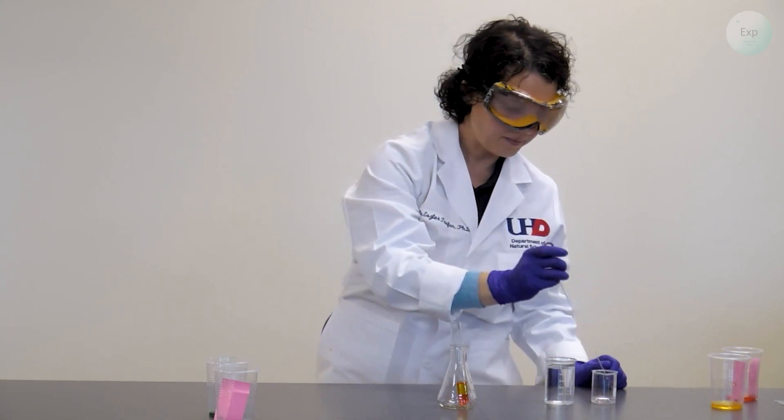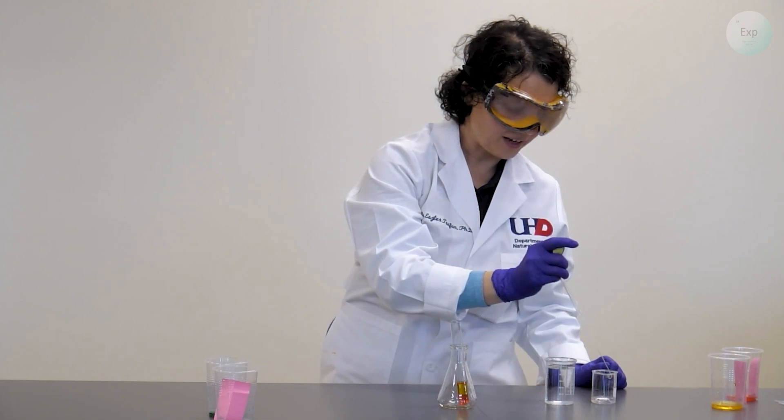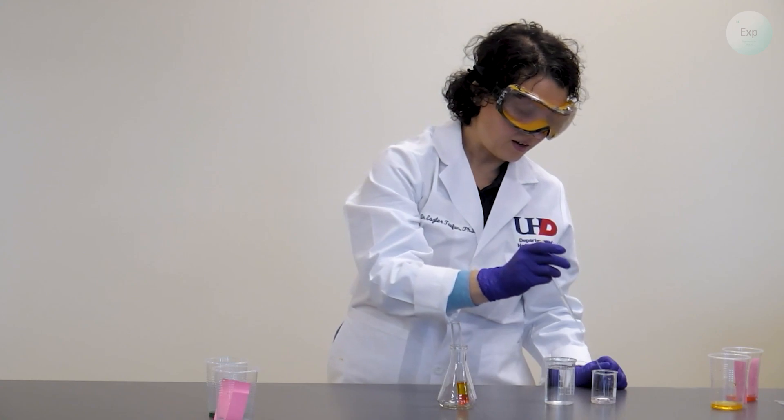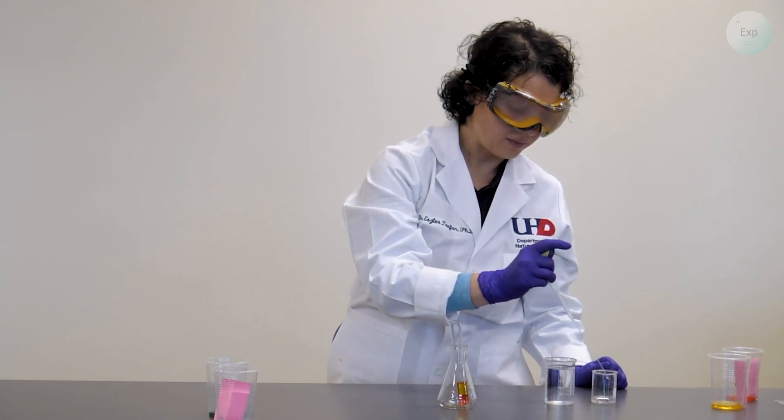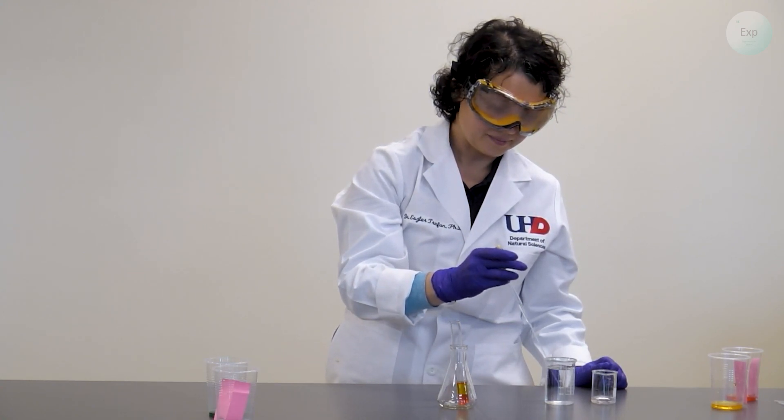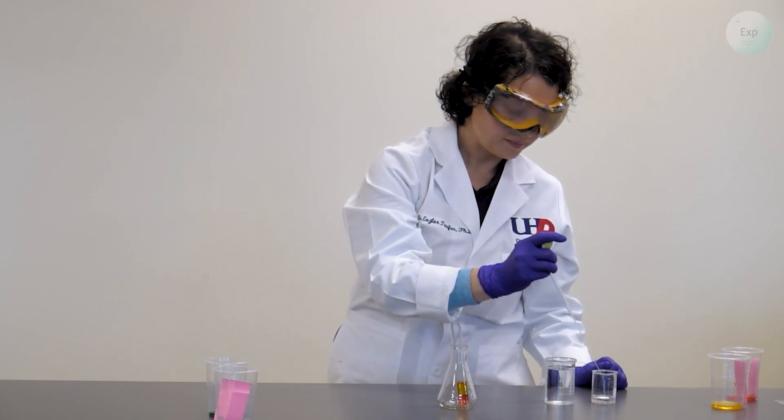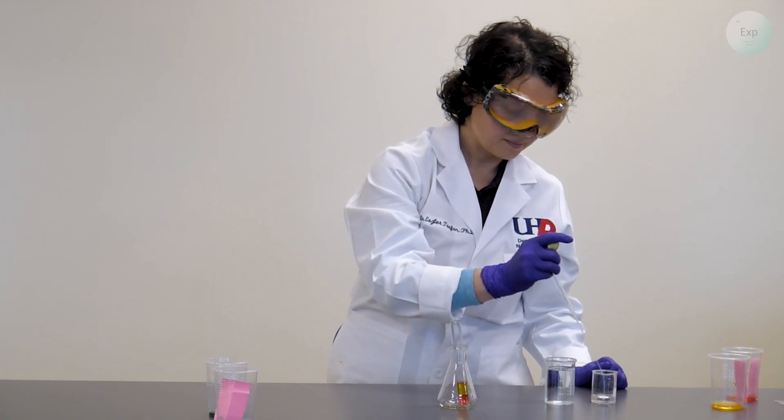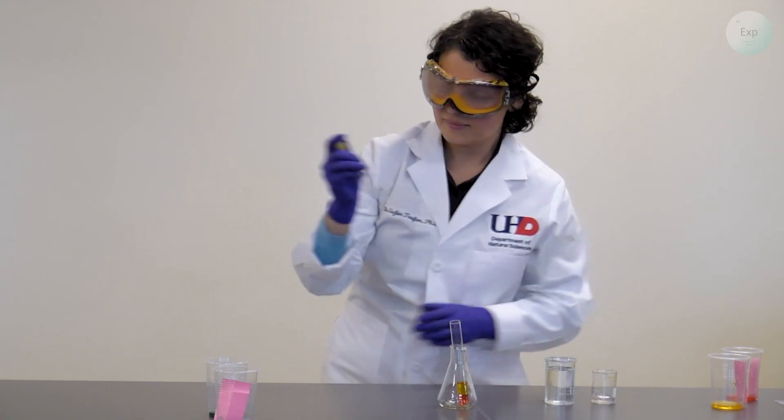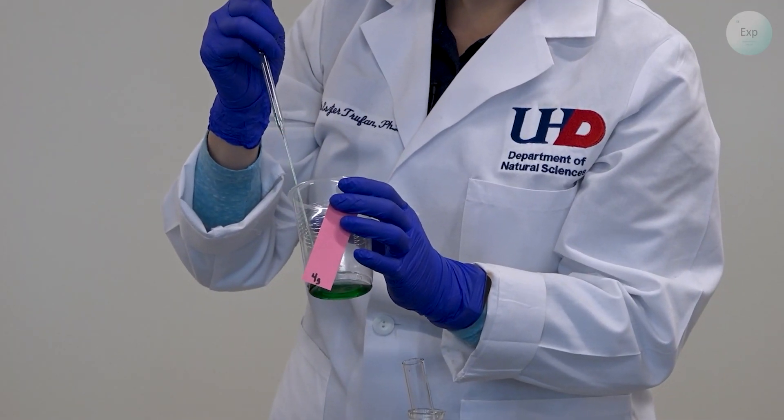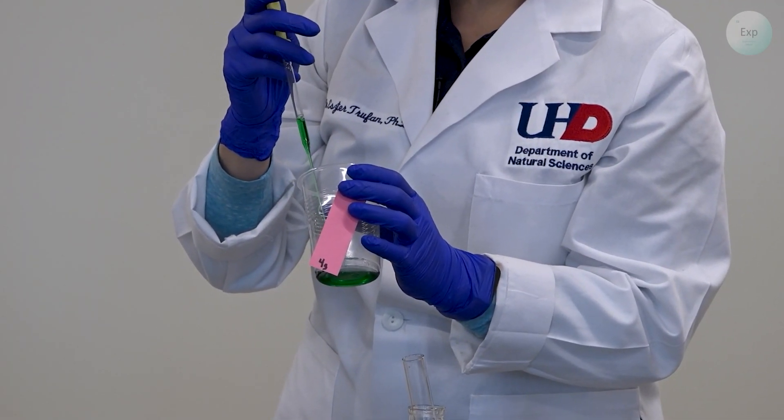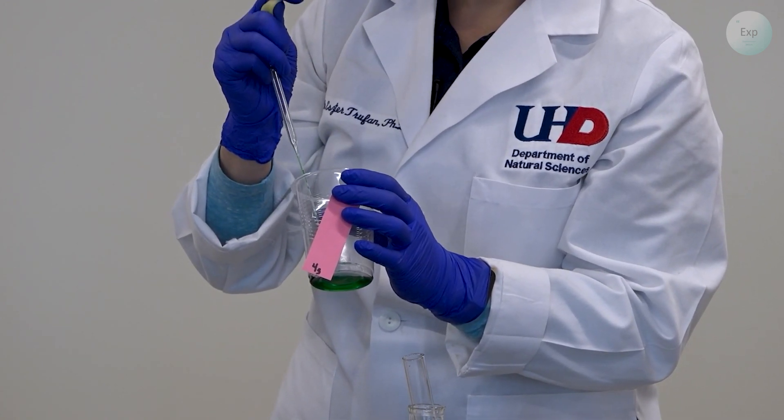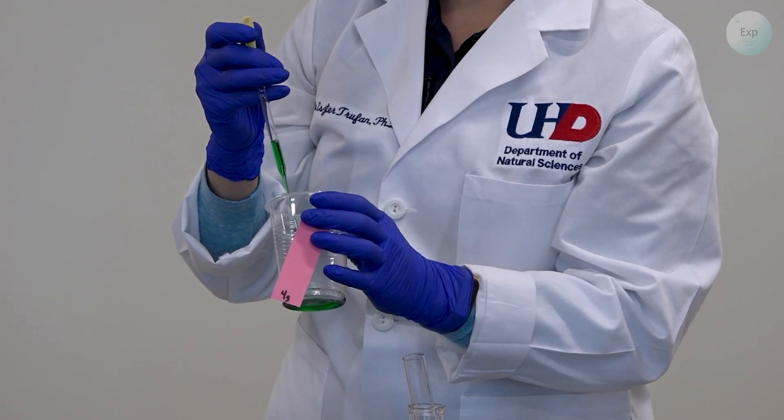Just like before, we need to squeeze out all the yellow solution, pull up some clean water and then transfer it into a waste container or the sink. Next, we rinse the green solution into the pipette and we're ready to do the layering with the green solution.